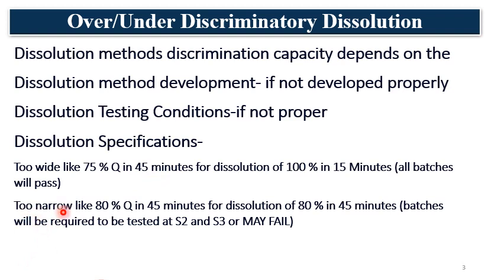Then too narrow, like 80% in 45 minutes for a dissolution of 80% in 45 minutes. That means for this type of specification, the batches will be required to be tested at S2 and S3, and also they may fail because it is a very cut-to-cut type of specification, which needs to be relaxed a little bit.